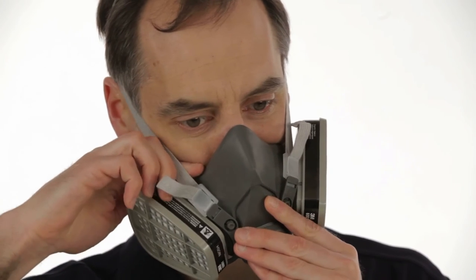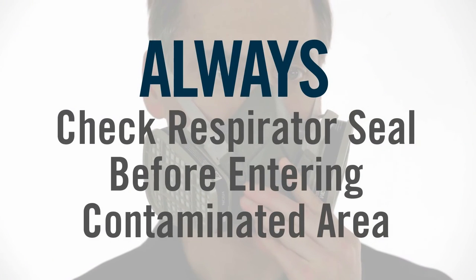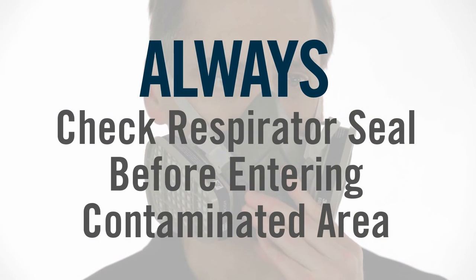Do not pull the straps too tight. If the straps are too tight, push out on the back of the buckles to loosen them. Always check the seal of the respirator to your face before entering a contaminated area.